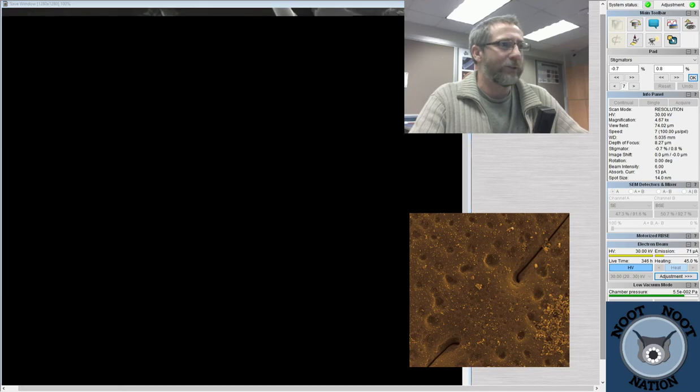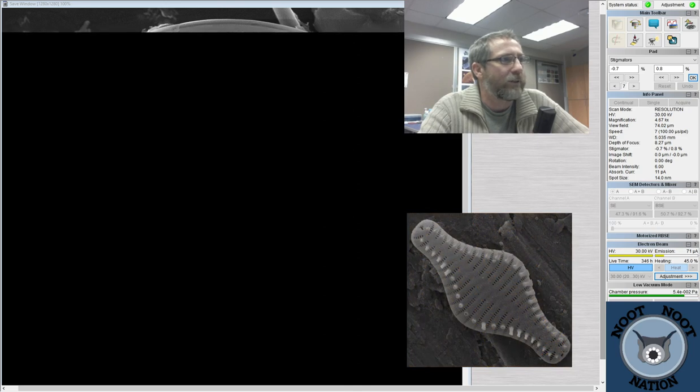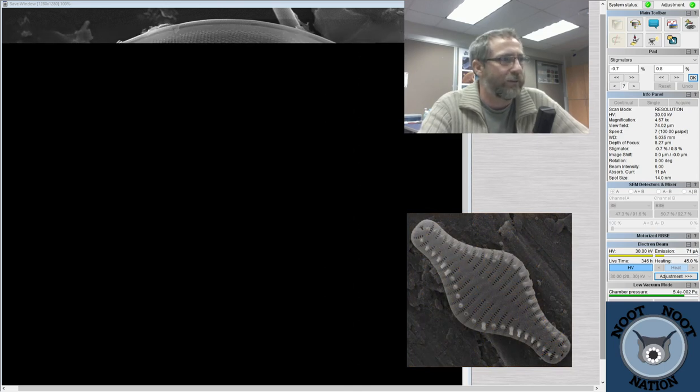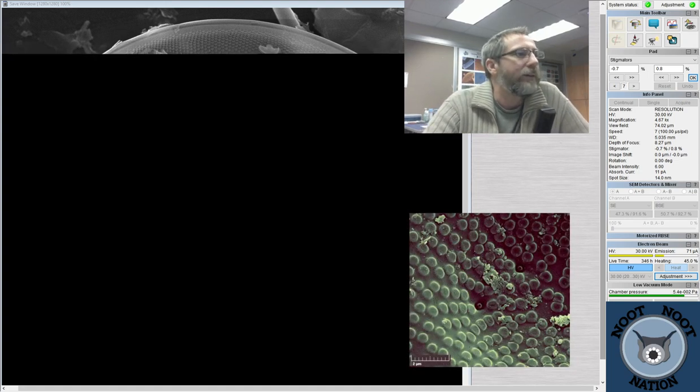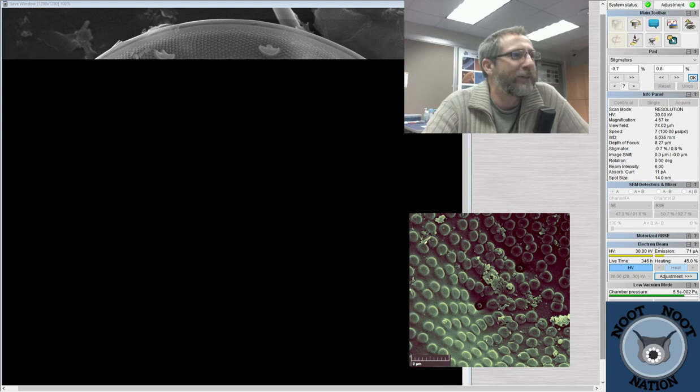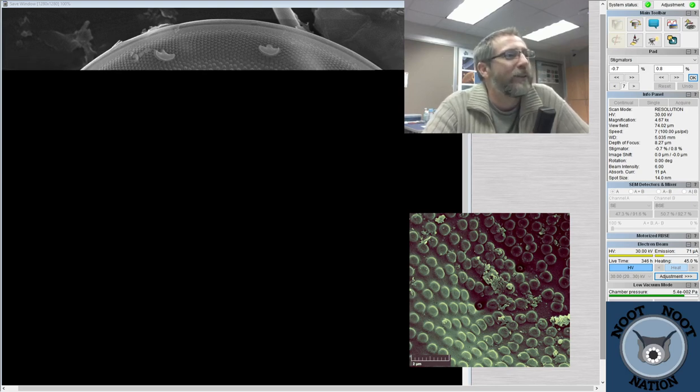And I can come back and see what chat's been saying. Right. Bluebird, what are we looking at now? This is actinocyclus, it's a diatom. We're looking at diatoms from San Francisco Bay. So, everybody thinks it's a nightmare for people who hate little holes.